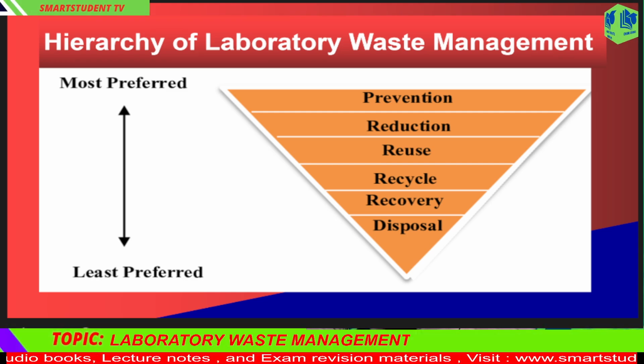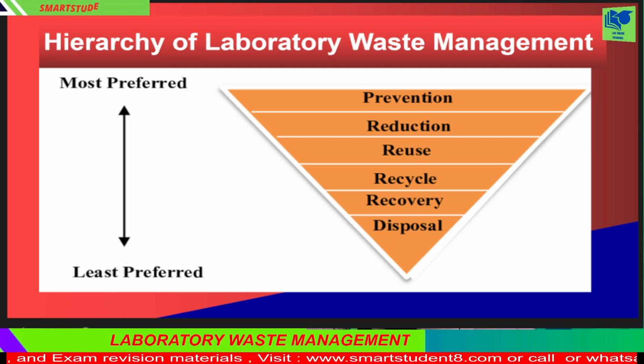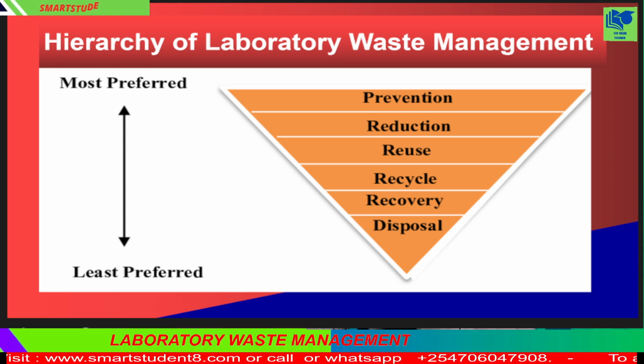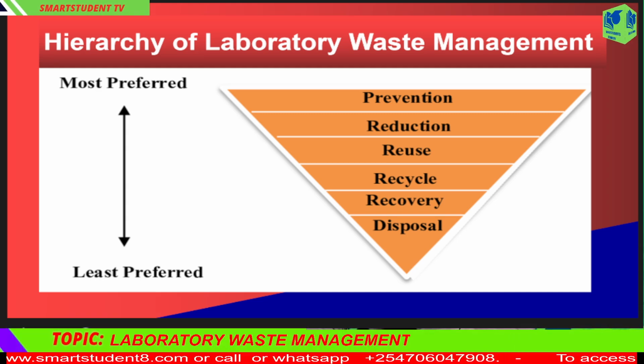The initial responsibility for implementing this hierarchy rests with trained laboratory personnel. These individuals are in the best position to know the chemical and physical properties of the materials they have used or synthesized. They are responsible for evaluating hazards, providing information necessary to make an accurate waste determination, and assisting in the evaluation of appropriate strategies for management, minimization, and disposal.